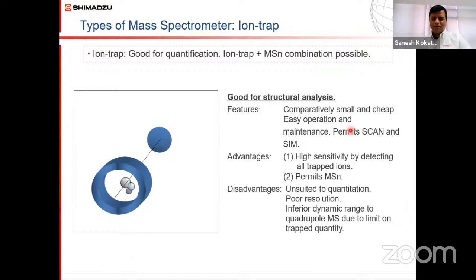There is another principle we call the ion trap. The ion trap is a good tool for quantification, as we can trap a particular ion if you know the molecular weight. Example, the mass is 501, that is your molecular weight, and I need to trap the 250 ion in the trap. So 250, obviously, is probably a fragment of 500. I'm just guessing the fragmentation pattern.